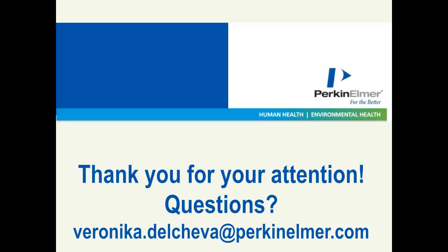I'm going to hand over another question to Julius, and this is from Andreas Bress at the ENT clinics. His question is regarding what the resolution is like for really large proteins, and he gave the example of titin. Titin is a really bad example. It's a huge protein, so I think no one will ever be able to purify that. I mean, it's 5,000 kilodaltons, and it's really huge.